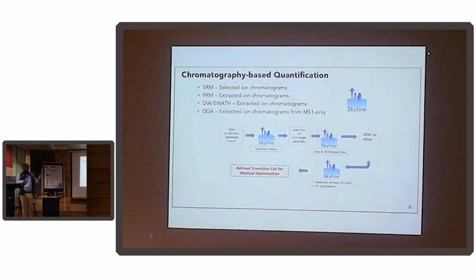So you do a selection of target peptides, then you go to the SRM and PRM methods, you set up the method where you just detect only those specific 8 to 10 product ions, right? So now you are cutting down the job for the instrument. The instrument is not looking for the entire peptides, all the ions. You are selectively telling the instrument to look for only those guys with red hats, right?